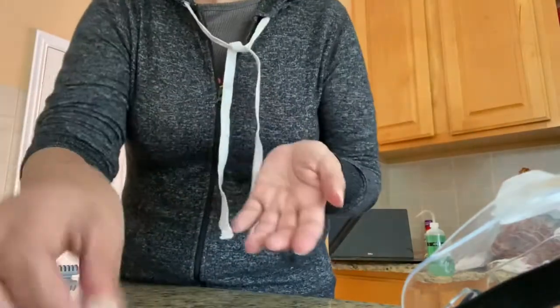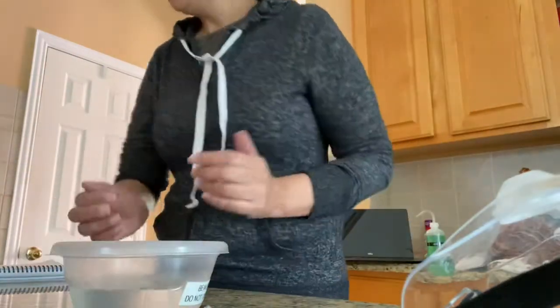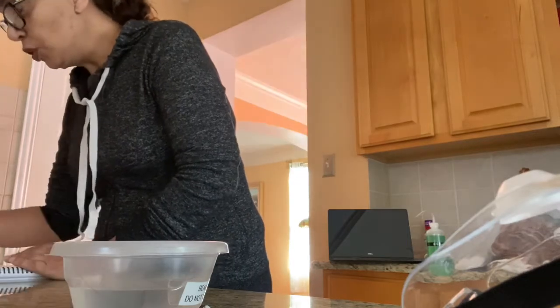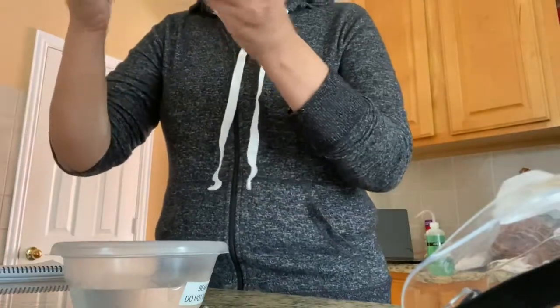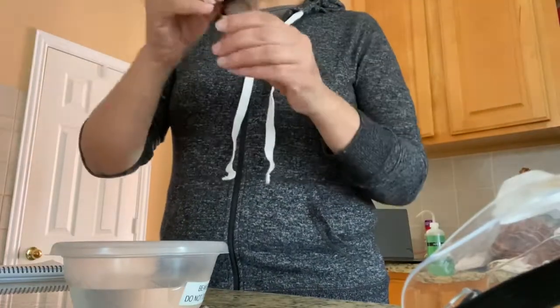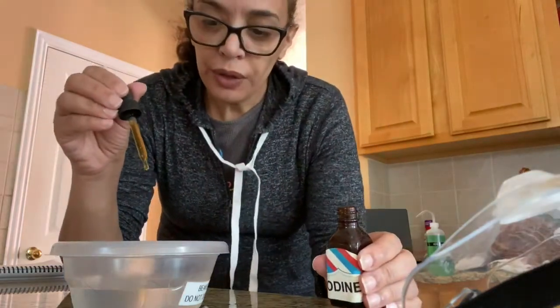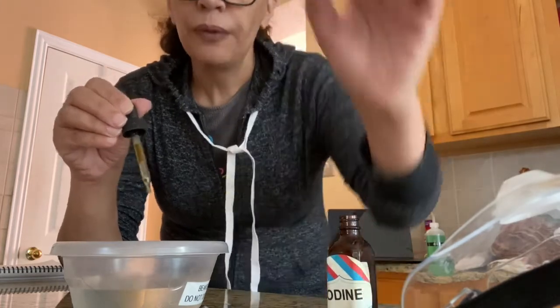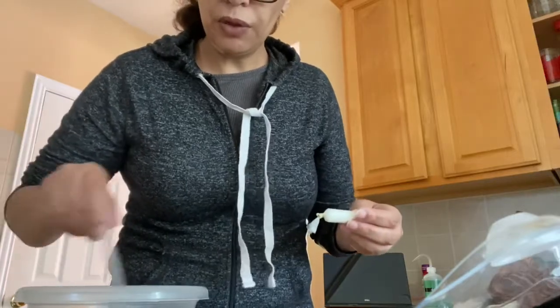As you can see, I tie it very well. Nothing is leaking, right? And I take my 200 milliliters of water, and I am going to put 15 drops of iodine. 1, 2, 3, 4, 5, 6, 7, 8. Let me see if I can mix it very well.